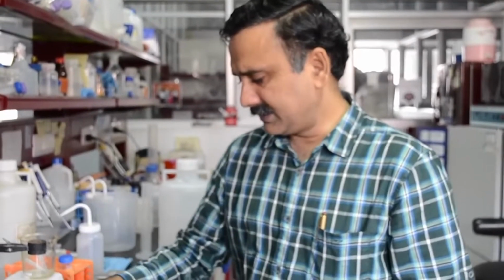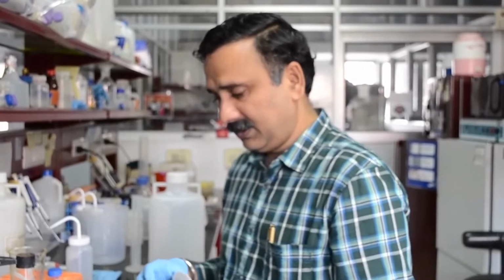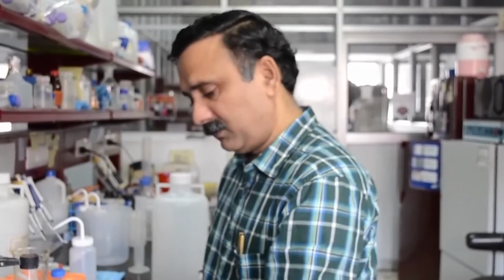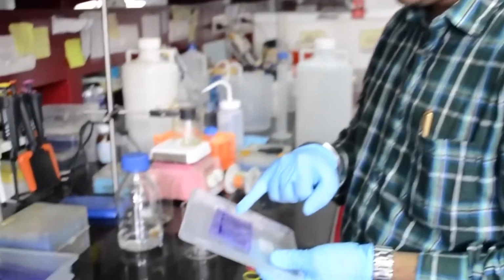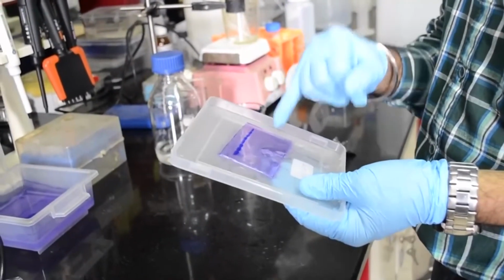electroelution experiment. In step 1, we first have to see which band you have to isolate. For that purpose, you first have to check where the protein or the antigen is located.